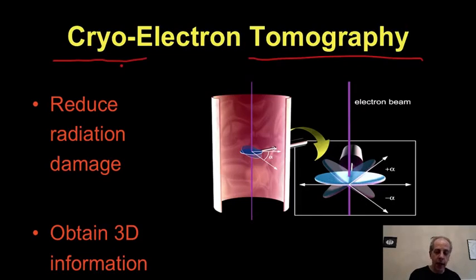Now, this technology helps to reduce radiation. This is very important. When light is hitting me, you can take as many pictures as you want of me. I'm not going to get hurt by that. When you throw electrons at a specimen, you're hurting the specimen. You're changing it. So you're changing the shape of what you're trying to understand the shape of.